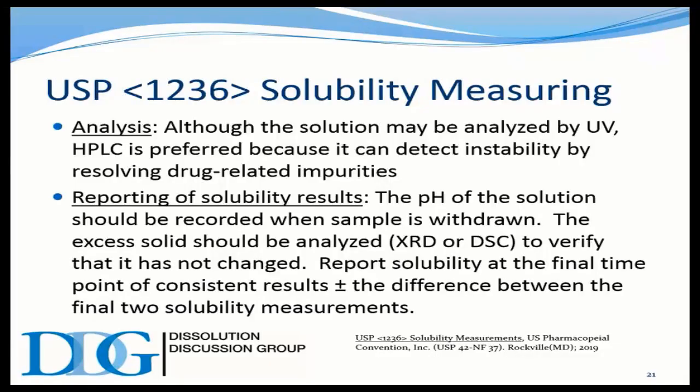Is there a question? Yes, the question is, how can we determine the rate of solubility for API? The rate of solubility. Well, that could simply be done, but you're not going to want to do it in excess. Even doing a solubility measuring test, if you took a lot of samples out of it in its early stages, you could maybe get an idea of rate.